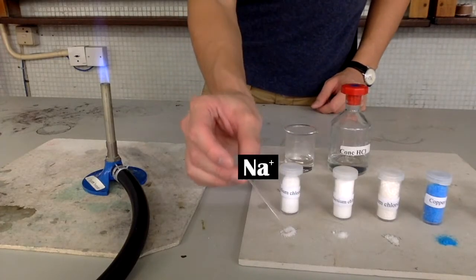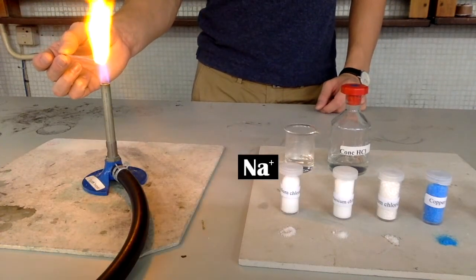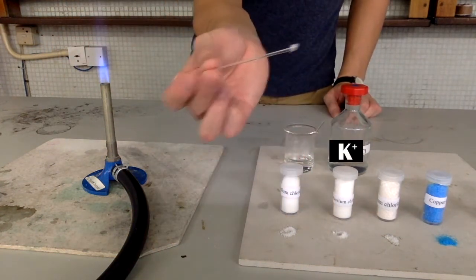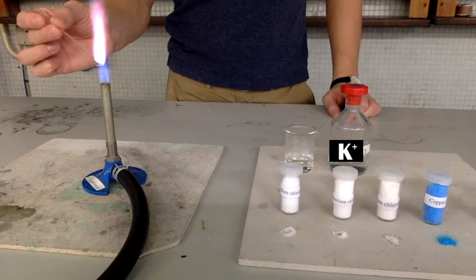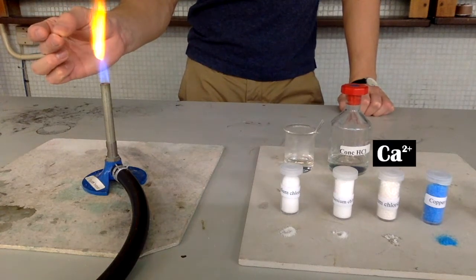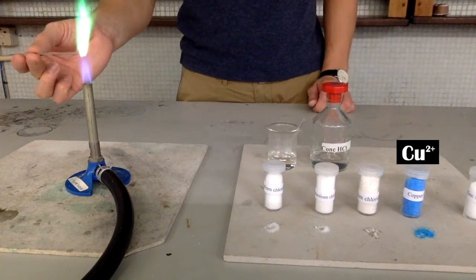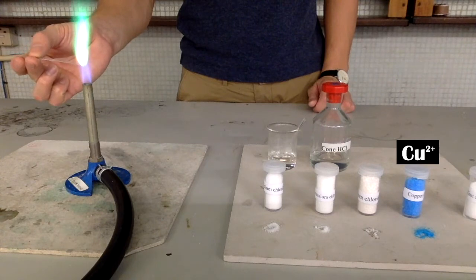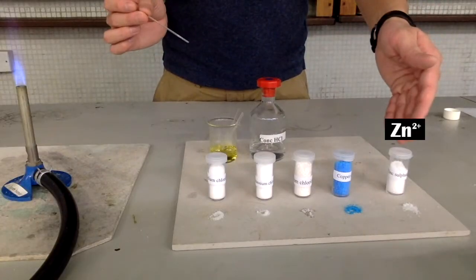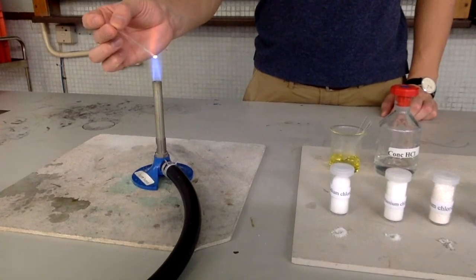Obtain the sample at the tip of the flame test rod and heat it with Bunsen flame. Sodium ion gives a golden yellow flame. Potassium ion gives a lilac flame. Calcium ion gives a brick red flame. Copper 2 ion gives a bluish green flame. Zinc ion doesn't give any characteristic flame color. Therefore, it shows a negative result.